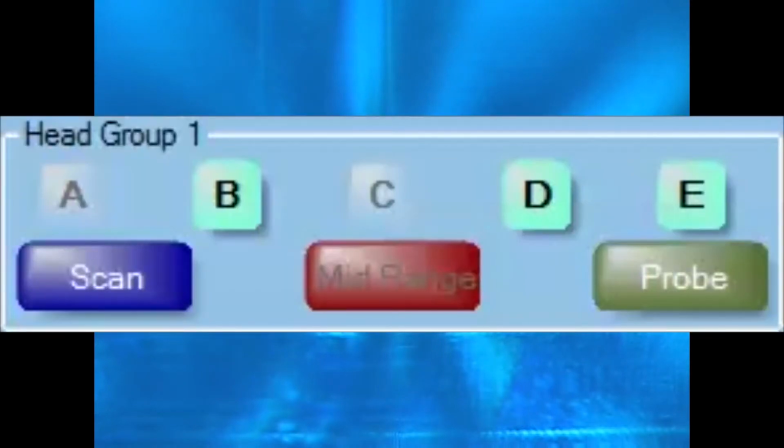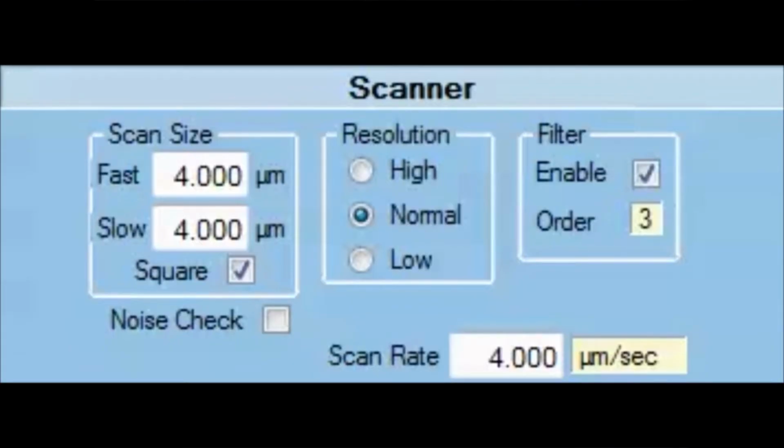A vital part of the AFP process is to create an overlay. Move the sample to the corner of an array or area with easily identifiable features and scan over it with the tips. Adjust the scan size to make sure the tips will scan over a common area. A larger scan will ensure this at the expense of time. Slower scan rates are necessary for smaller technologies.